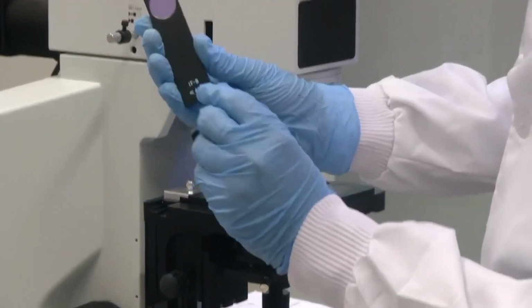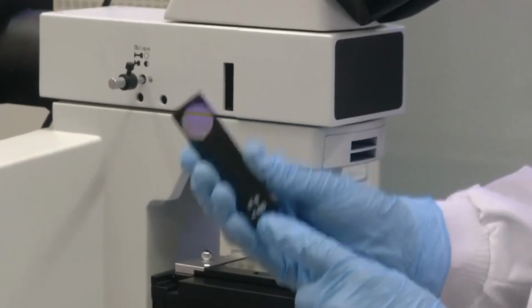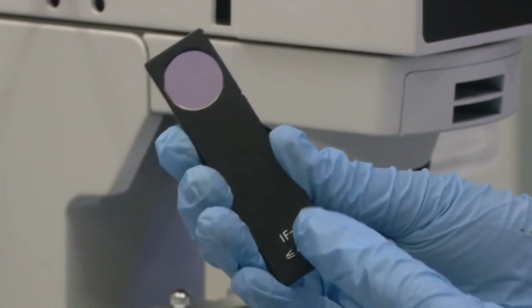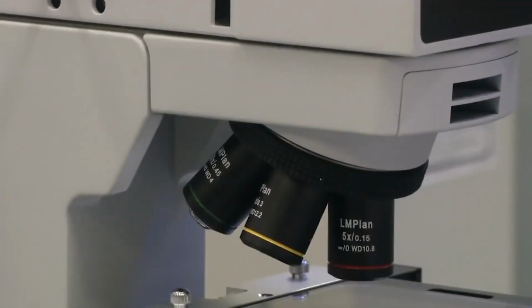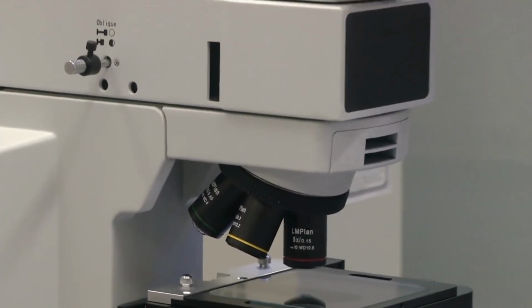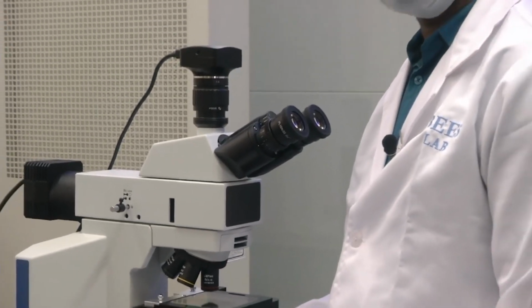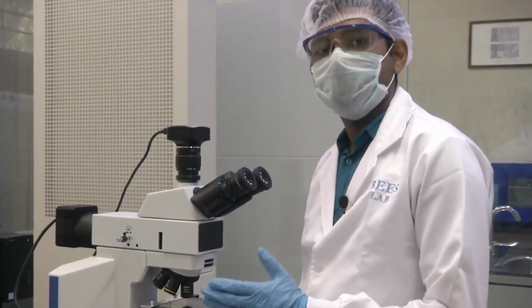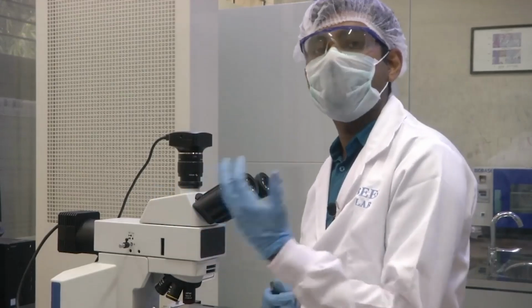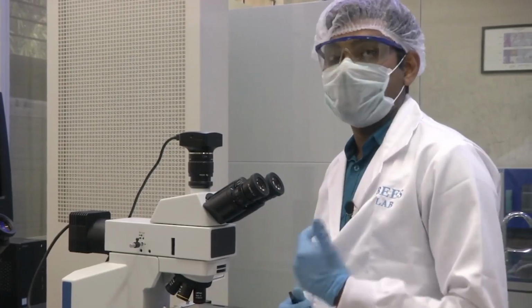If you can see, it is written IFB less than or equal to 480 nanometer. This is the wavelength of the light. So it is telling you that it will pass anything below 480 nanometer, and that is blue light filter. So as you know, if you are aware of optical microscopy and energy related relations, blue light has more energy than yellow light. Yellow light goes closer to the infrared spectrum. Blue light goes close to the ultraviolet spectrum, and blue light has lower wavelength. Yellow light has higher wavelength.